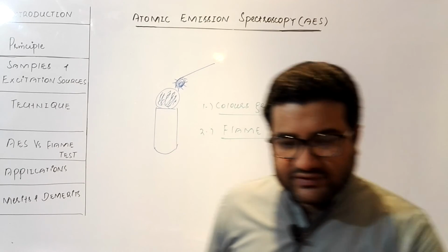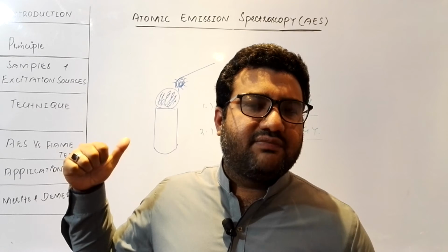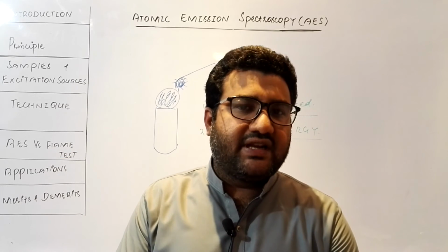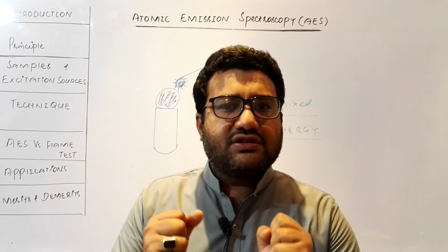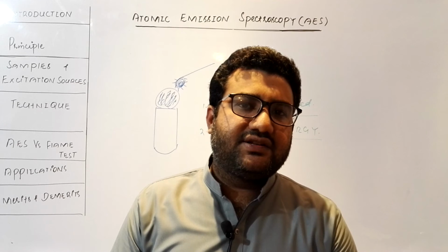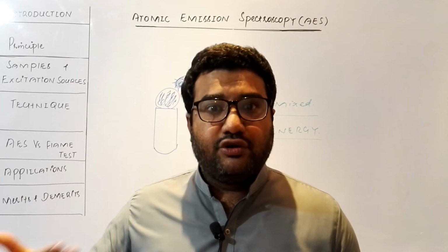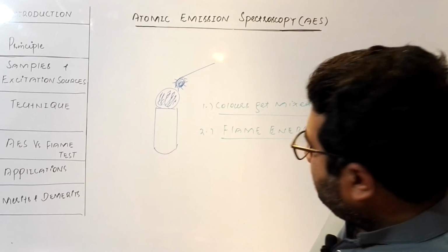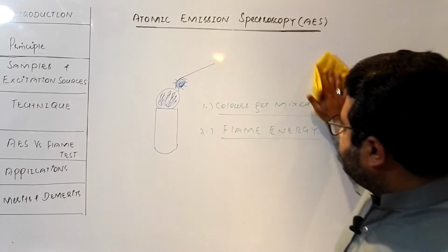But in the case of atomic emission spectroscopy, I discussed with you flame atomic emission spectroscopy because that was quite a simple case. But nowadays plasma is used, and plasma gives so much of the required energy that electronic excitations can easily take place, and we can observe what we actually want to observe. So this was atomic emission spectroscopy versus flame test.